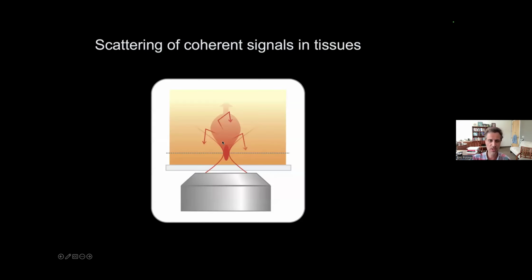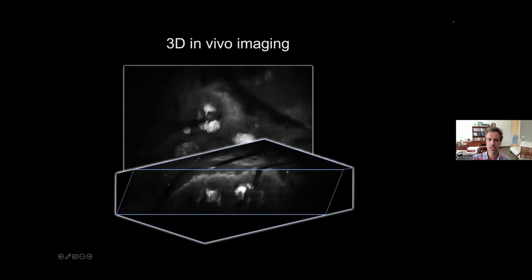Why is that important to realize? Because in this process, most photons will be constructively interfering in a forward direction, not in the backward direction. However, the forward propagating photons will be backscattered at some point. So if you start collecting in the backward direction, what you basically are seeing is forward propagating light that is then redirected in the epi direction. And that is basically what you see when you do tissue imaging with CARS or also second harmonic generation type of imaging. All the signal is initially propagating forward, but then is backscattered due to tissue structures. And that is what you are collecting on your detector.